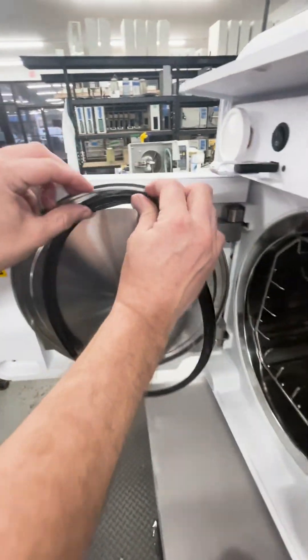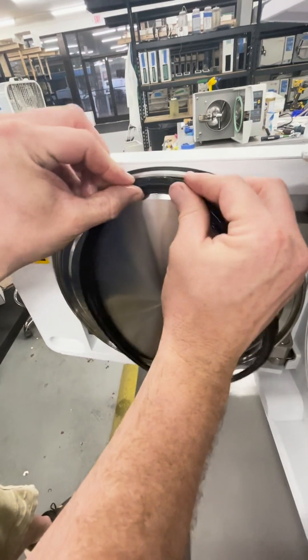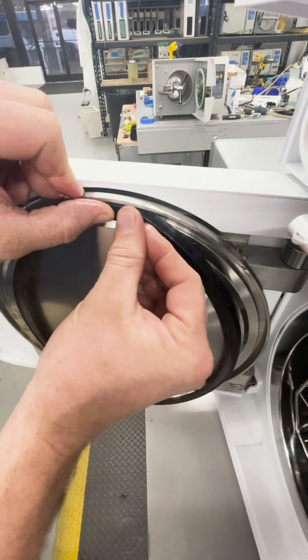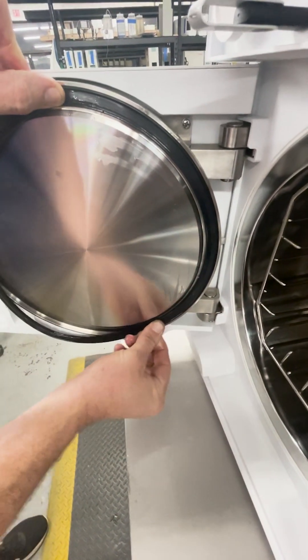I'm going to start at the top, get this inner lip into the groove, and press in on one section so I have a small piece seated. I'll hold that and work my way around the door.